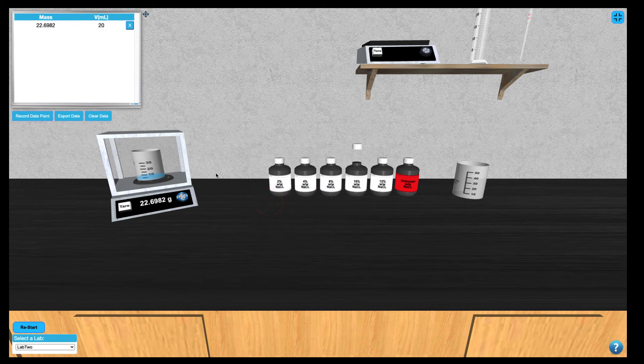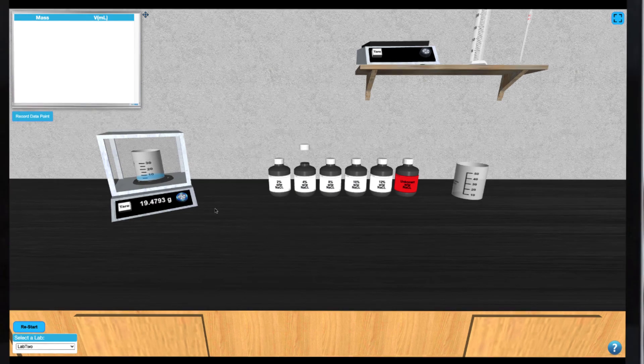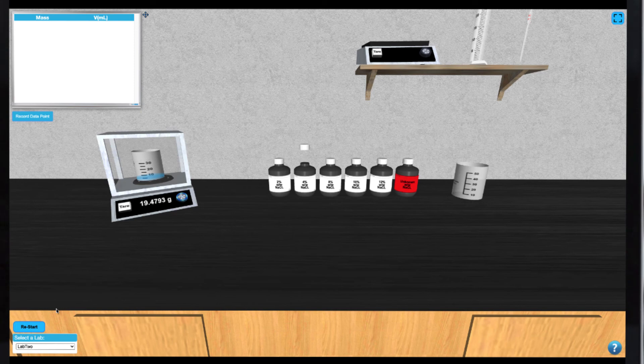When complete, you can export this data into any spreadsheet program. Again, you can explore this process using several pieces of glassware and or balances.